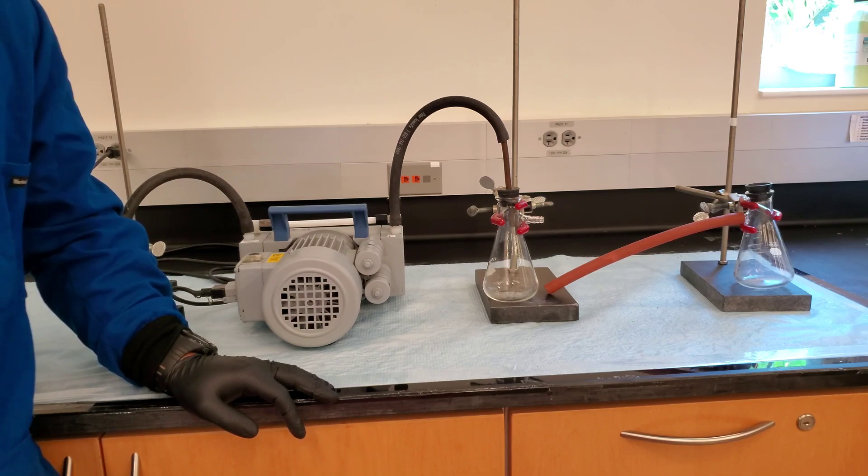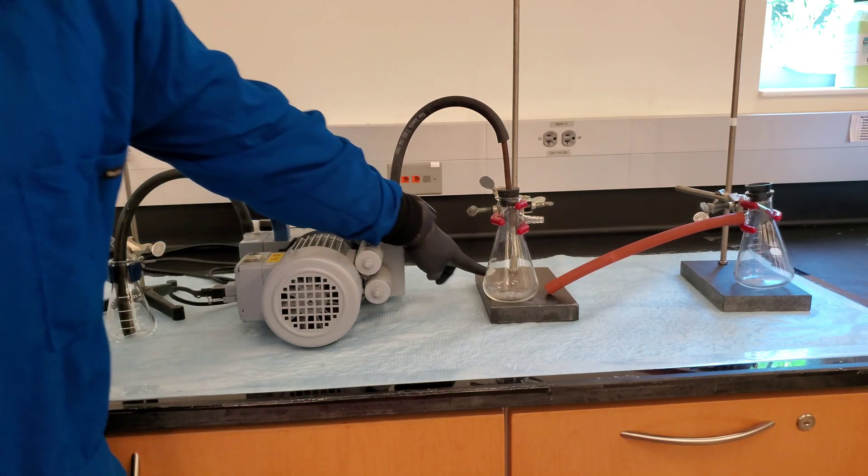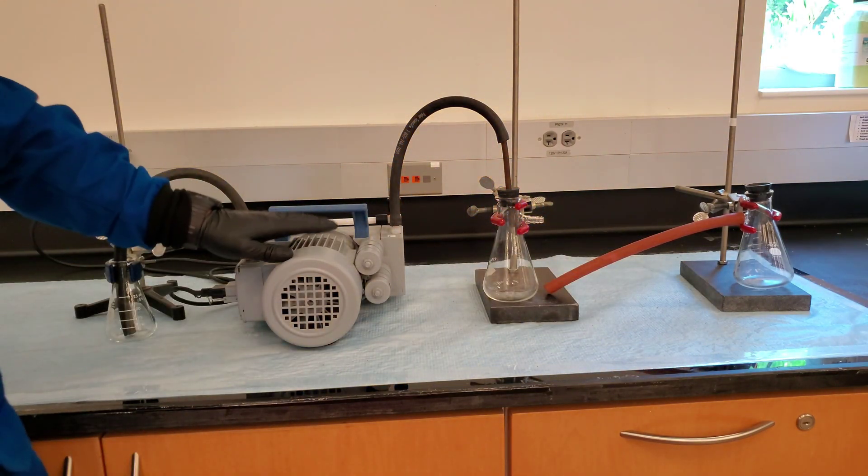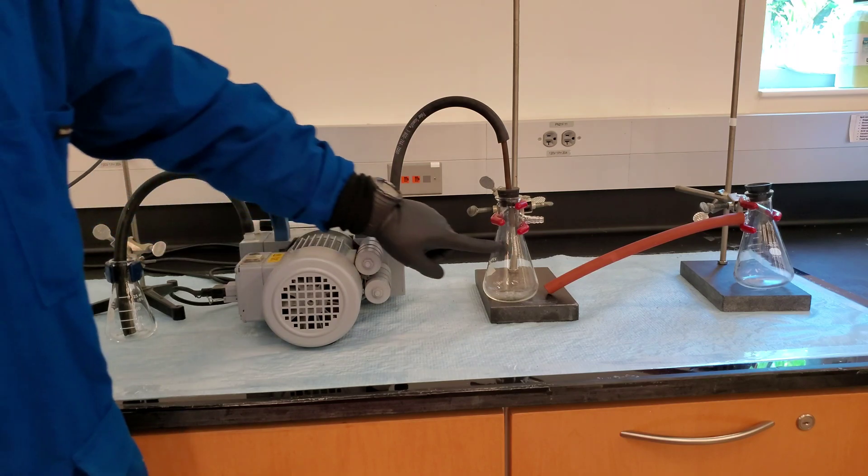We will be using a filter flask as our trap. Let's get started. Materials needed include support stands, vacuum pump, and two filter flasks.